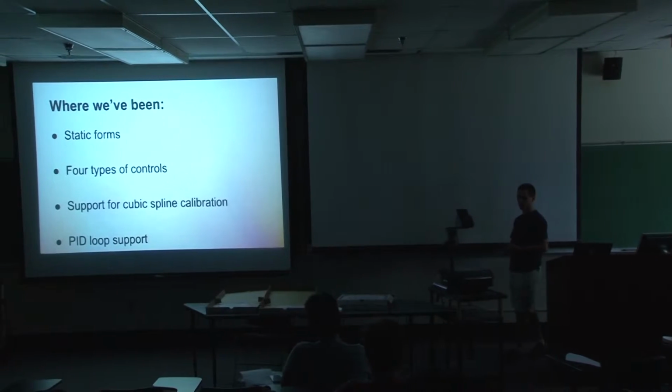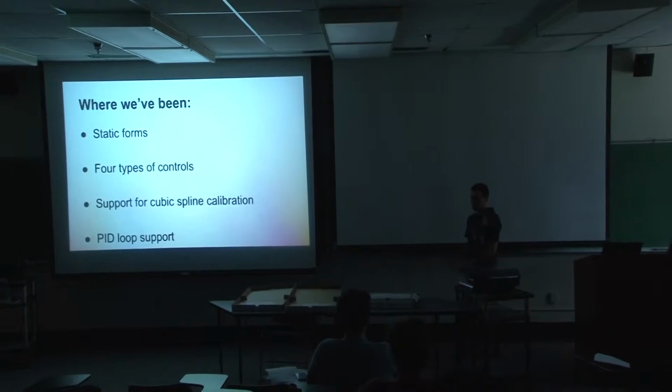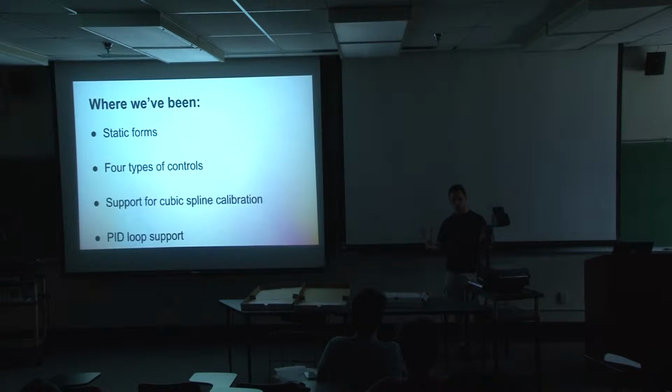So yeah, we're in static forms. There are 4 different types of controls that are currently implemented. Just buttons, like on/off to toggle equipment status. There's a spinner, to select numeric values. There's also just typing an entry into a text box, and that sends it over serial with the proper command. And just being able to display a numeric value that the equipment returns.